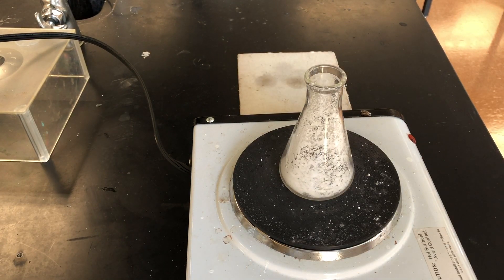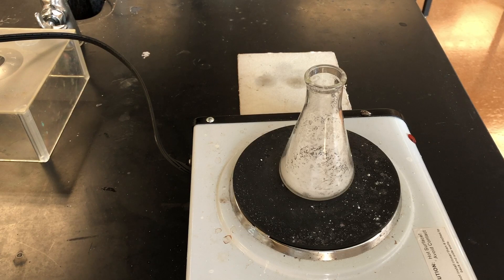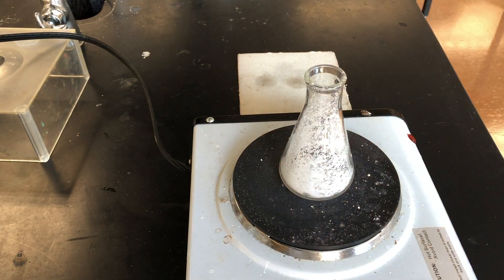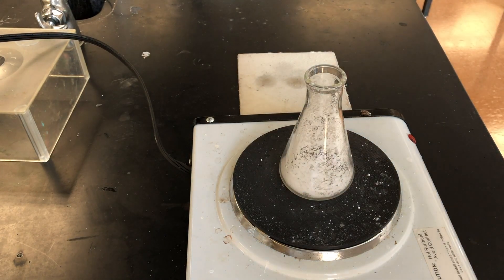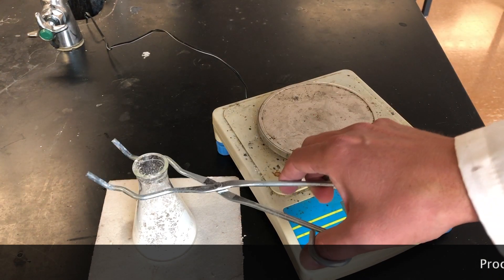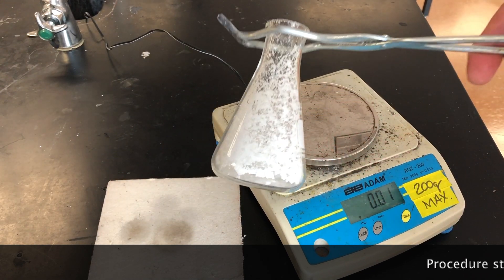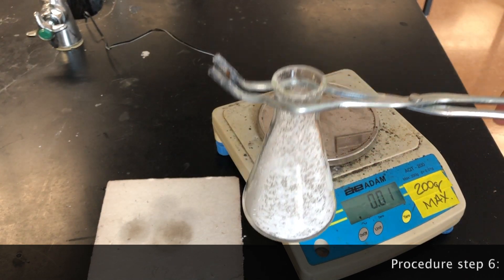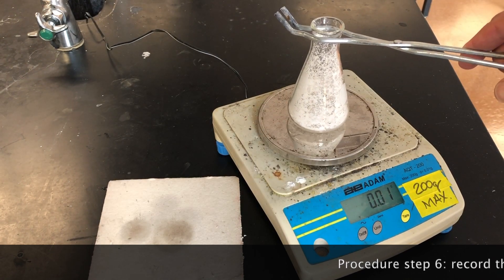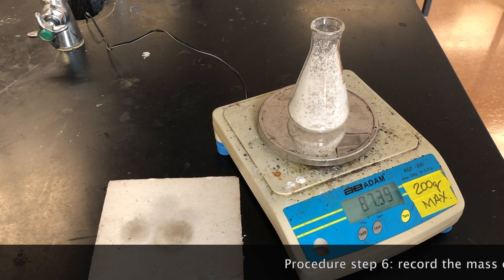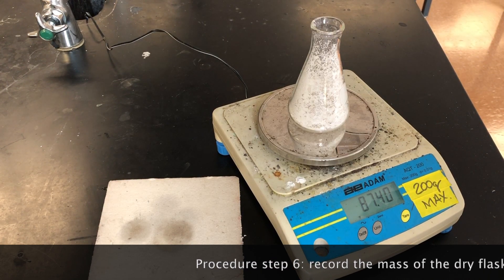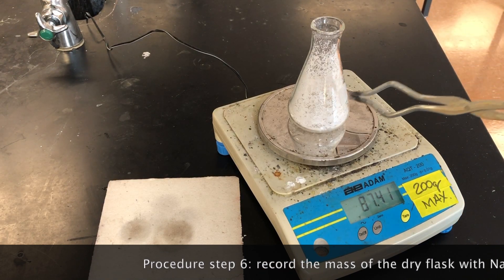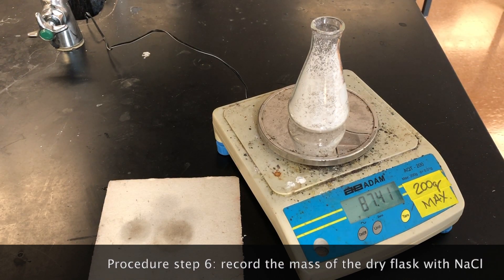Now that the steam has completely stopped, we will turn off the hot plate and set the Erlenmeyer to cool. Then we will be ready to take the final mass. We can look at the Erlenmeyer flask and feel quite confident that the water is completely left. There is no sign of moisture anywhere on the Erlenmeyer.